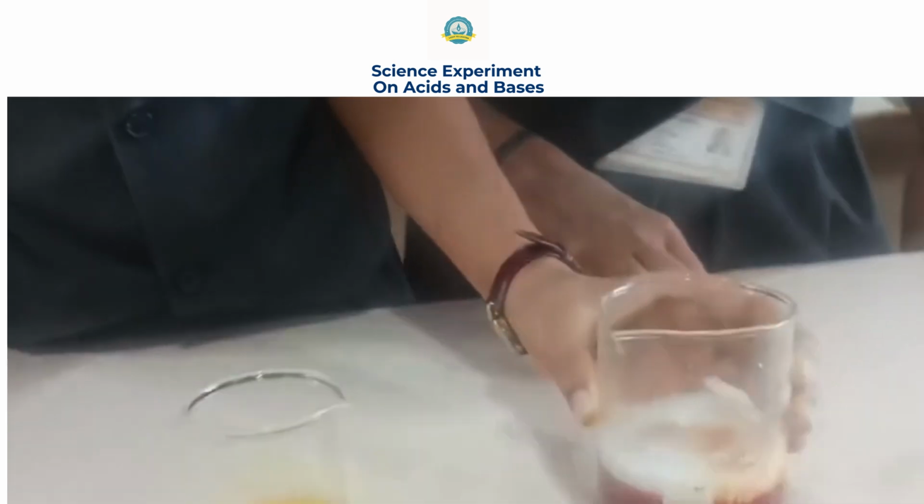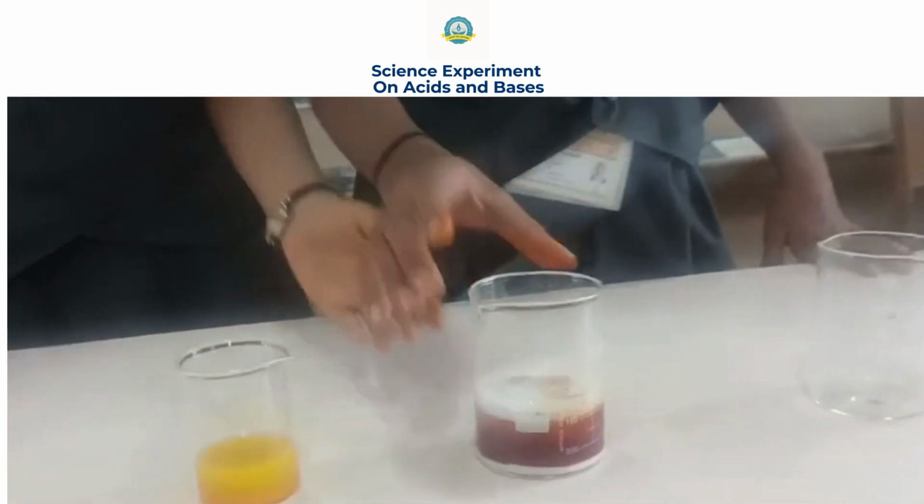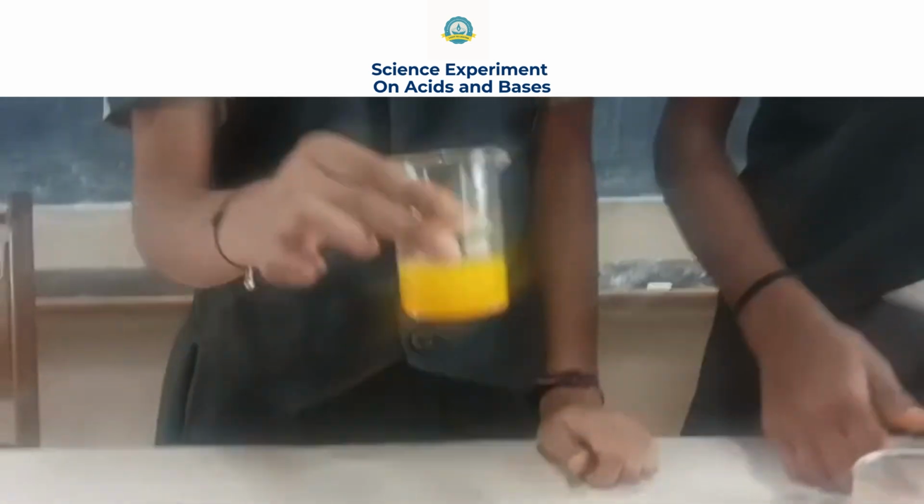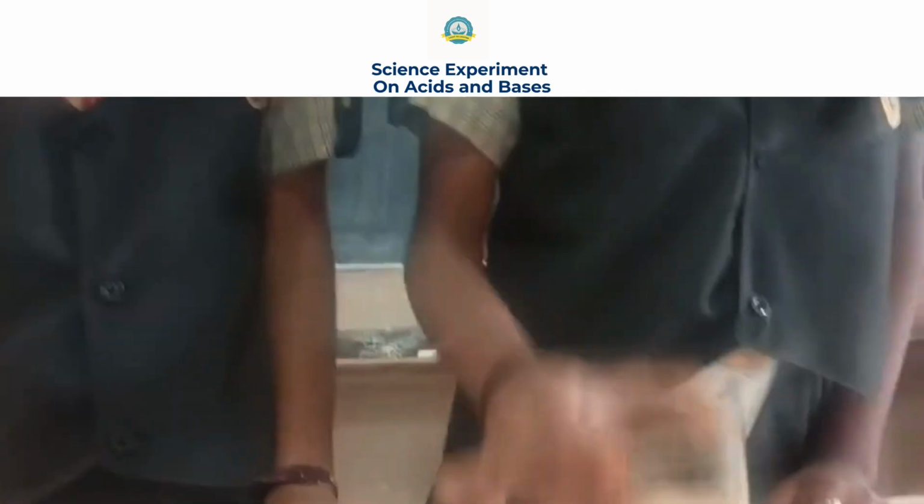Red color. So now this soap solution becomes red color. This indicates that this is a base. So now this is acid. So now this is base.